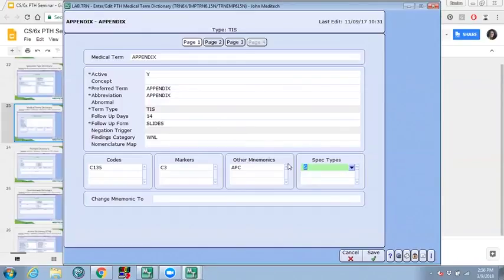So first of all, we'll start with the tissue term type and see how that is being defined. As I mentioned for the data section dictionary, if there are any prompts that are grayed out, that means that does not apply to the type that we are defining through this dictionary. And sometimes you will also notice that there are pages that do not apply to certain term types. So we'll start first with the tissue term type, and that's the appendix 1.